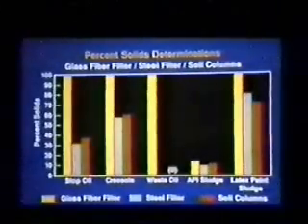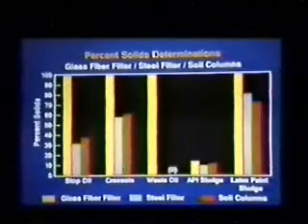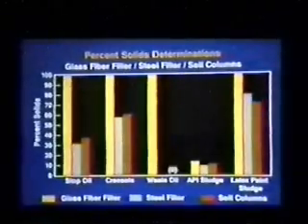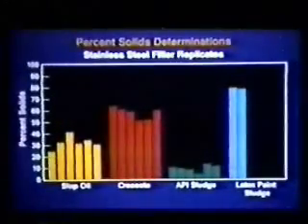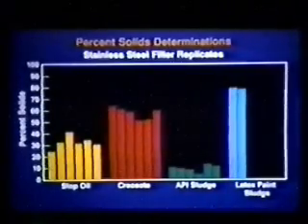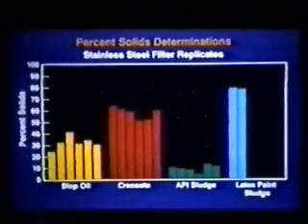In addition, we conducted the existing method 1311 in triplicate to see how much we had improved on the results of that method with the modified method. Finally, the triplicate results from the modified method were used to calculate the new procedure's single laboratory precision.